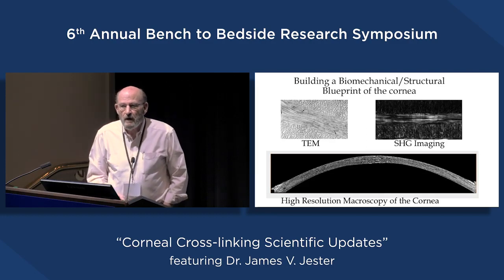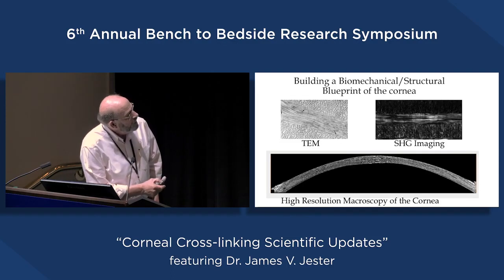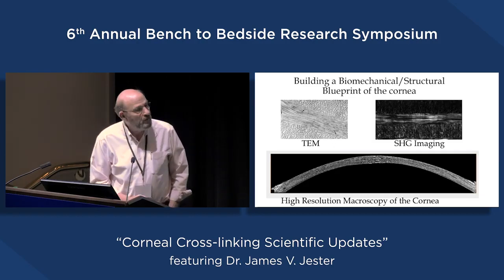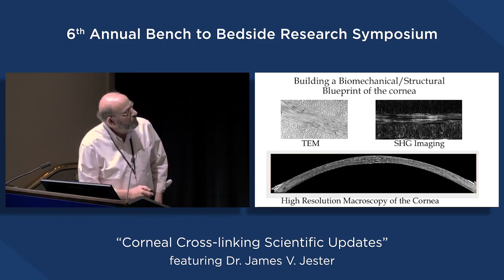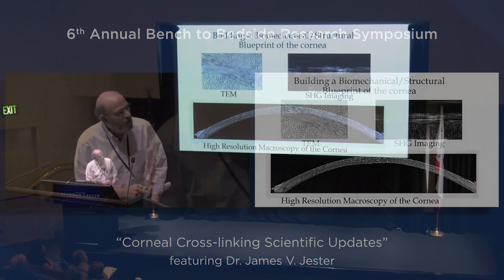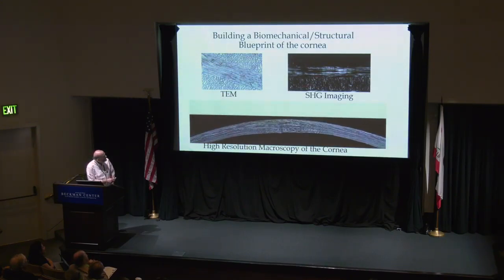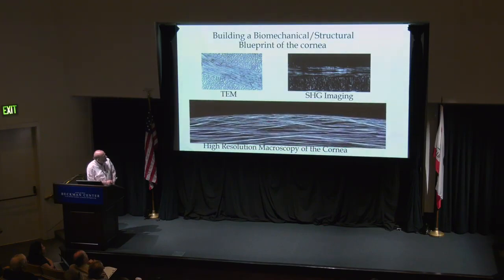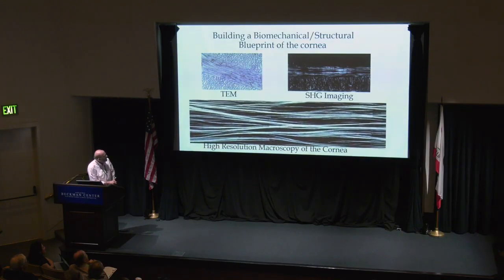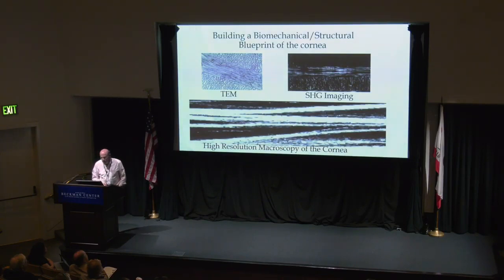We've been using nonlinear optical imaging of second harmonic generated signals, which is shown here. These lines correspond very nicely to the collagen fibrils that are seen by transmission electron microscopy. Of course, these are nanometers, these are submicron images, but you can see that fibers running in plane show up very nicely. We can take multiple images over the entire cornea and generate these three-dimensional Google maps of the corneal stroma, and then follow individual fibers as they branch and anastomose. So there's a branching, where fibrils are now going in two different directions.